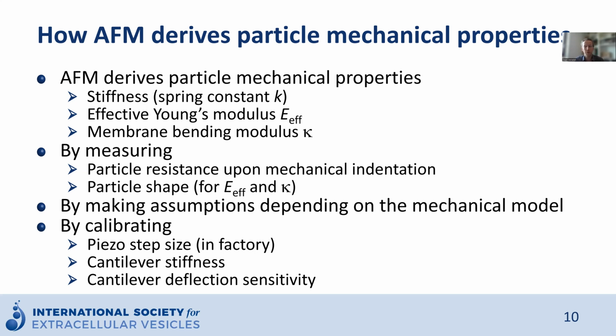So this one you have to calibrate for each individual experiment. Most commercial AFMs have implemented straightforward and user-friendly procedures to determine both the deflection sensitivity and cantilever stiffness.